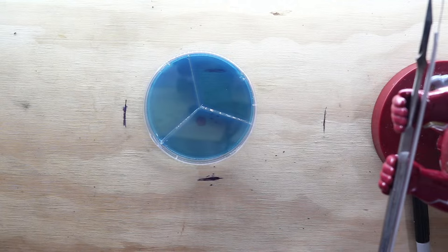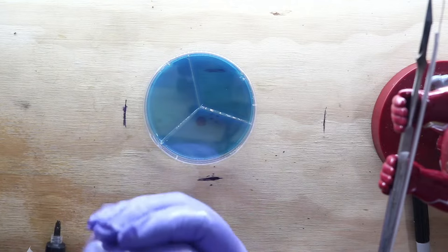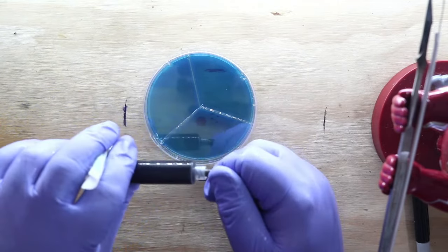Samantha, you got questions for me, honey? Yeah, there were a few. How long do you let the slants colonize before cold storage? Just until I can see that they're growing and that they're clean. As soon as I see that they're growing and clean, I will go ahead and just throw them right in the fridge. I don't have any specific date or time because every species is different.